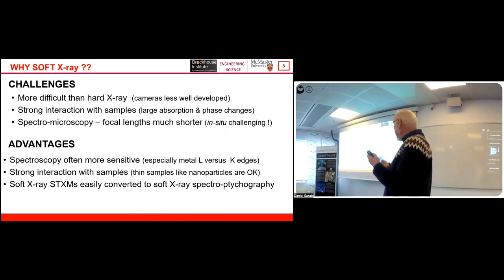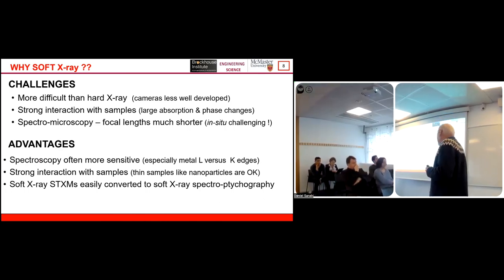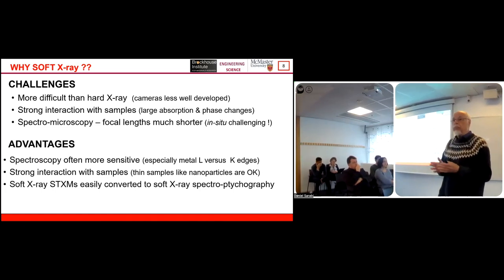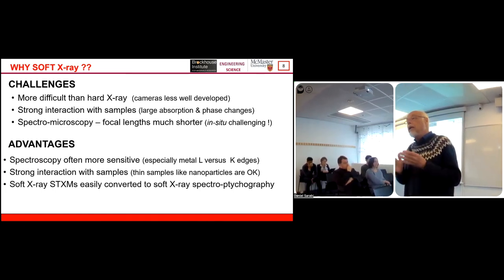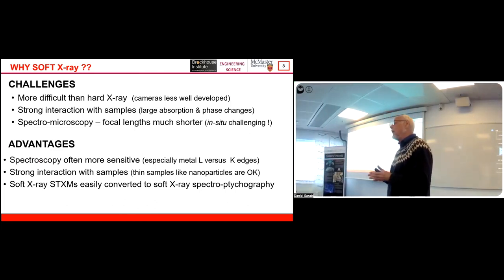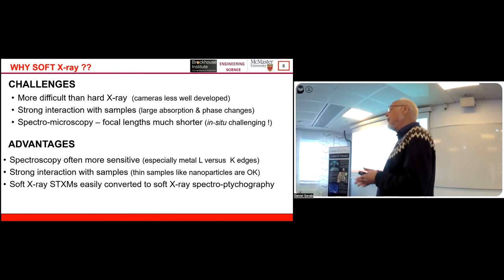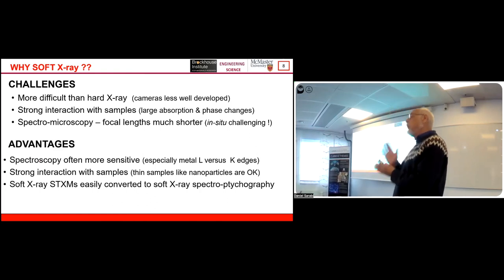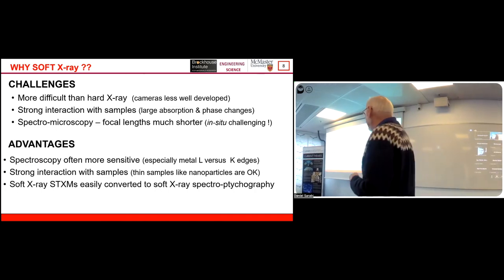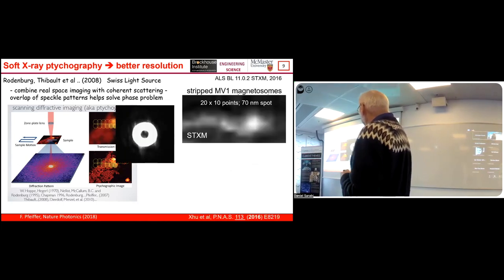And finally, in the practical implementation in the STXM, in order to couple a system to modify the property of the sample inside our microscopes, it's very hard in the soft X-ray because our zone plate focal lengths are typically in the millimeter range. And so we're trying to put a sample conditioning system with a few millimeters of space to do this. Okay, so that's basically the pitch.